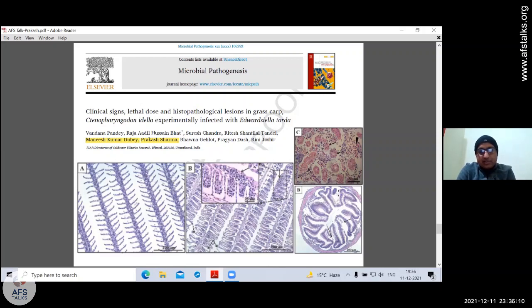I'm moving the cursor here. The complete degeneration, selective degeneration of the submucosa or the connective tissue. The mucosa is completely intact, the muscular layers and serosa are completely intact, but the submucosa is completely gone.